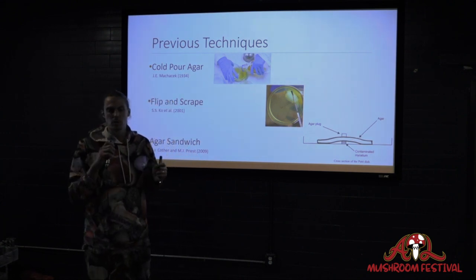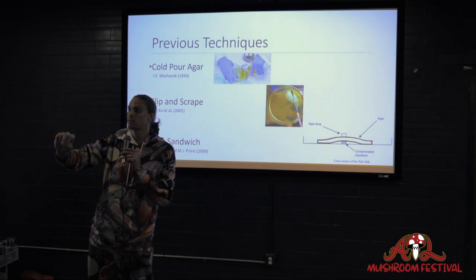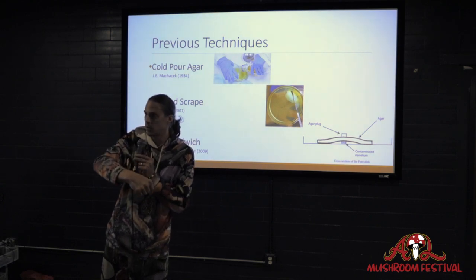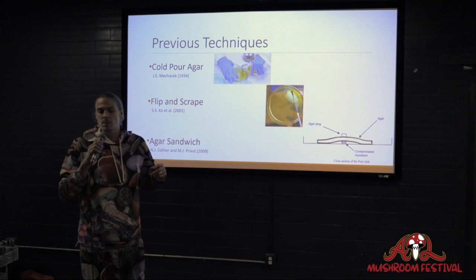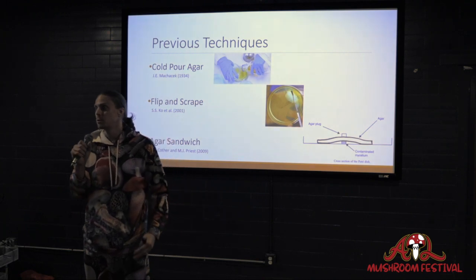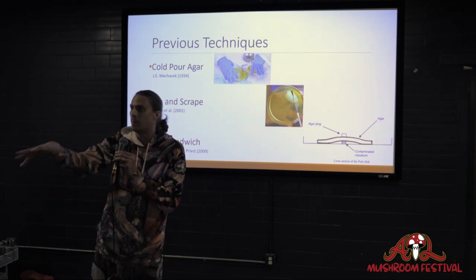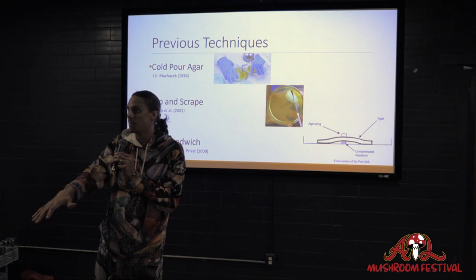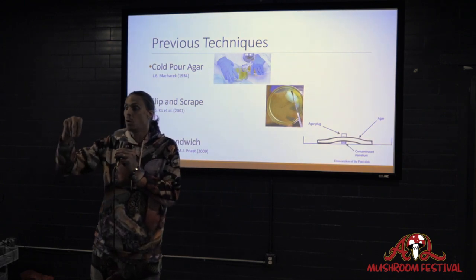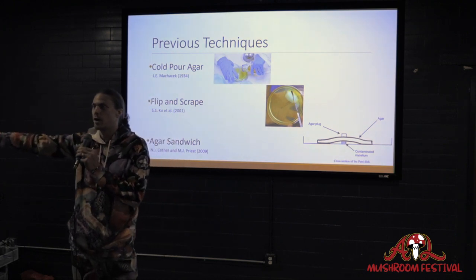Yes and no. If you're looking at fungal cultures, the fungal contaminant should grow slowly enough through the agar that you can isolate your culture of interest before the contaminant fungus ends up ruining it. And with bacteria, it travels with the mycelia over the surface of the plate, which is why a lot of people don't notice endogenous infections. If you have a raging infection on your plate, it will show up as a giant blob, and you'll see it. But sometimes that doesn't happen. And that's what you'll see later in this presentation: sometimes those infections grow along with the mycelia, and you never actually see them until you put them in a super high nutrient-rich environment.